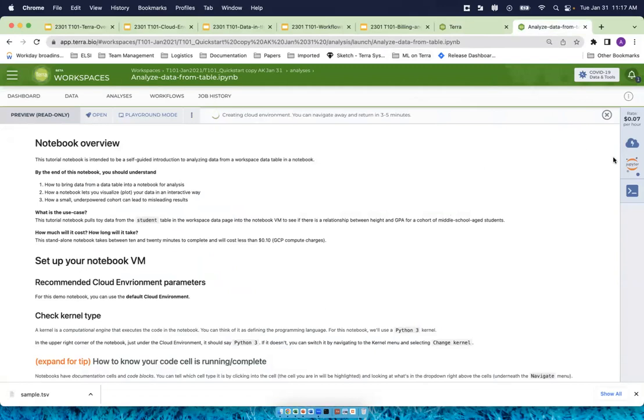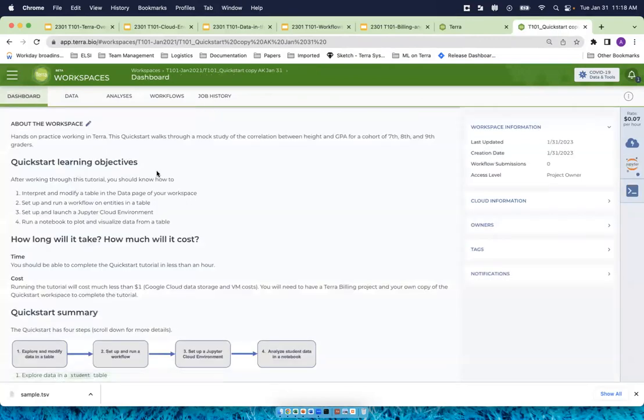Hello, yes. I'm not sure if I copied the correct directory, because when I open that, there is no script or analysis or data. There's nothing in the dashboard. So you have an empty dashboard? Yes. It seems like maybe you did not clone the correct workspace. If one of the TAs could please post the link to the Quick Start workspace one more time in the chat.